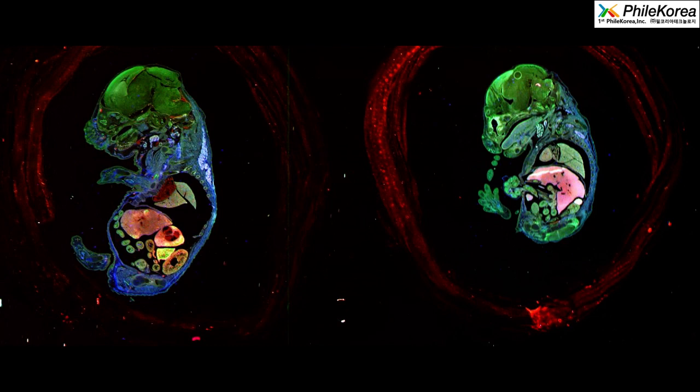We see here the embryo on the microscope slide. And we see very sharp all the organs, which is great. We see the brain. Look at this. We can even see the backbone or the fat. Look in the neck of the animal. Here we can see the fat. So very nice.